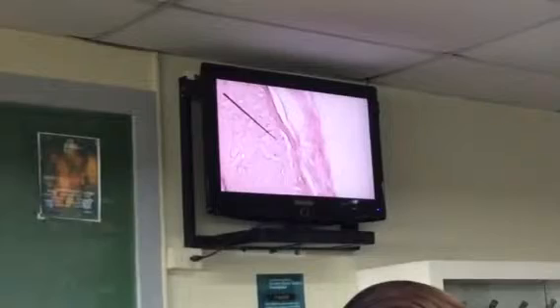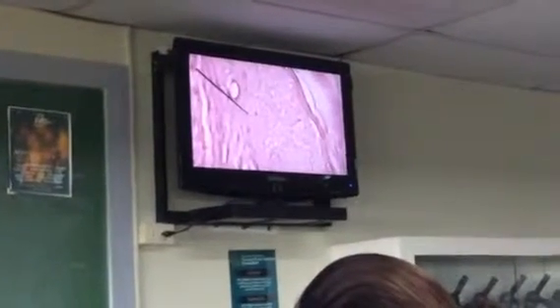This is the lateral wall. Ito po yung labas natin. This is the lateral wall. This, from outside, is what you call your bony lamina, or your bony layer, followed by your spiral ligament, and this portion here is what we call the stria vascularis. Ayan po, ito easily identify. Stria vascularis, spiral ligament, bony lamina.